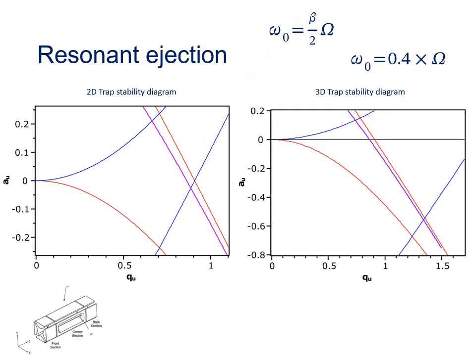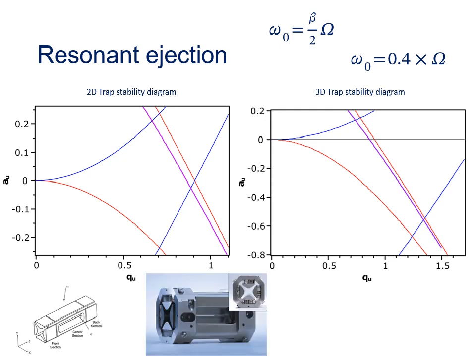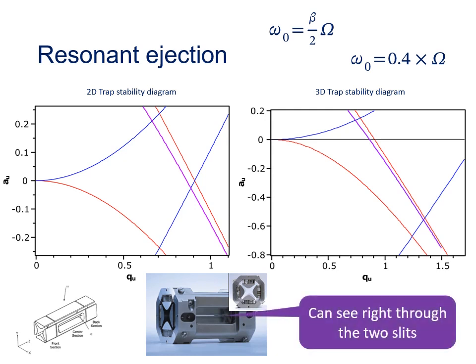As we said earlier, if we didn't use this approach, when ions reach the boundary of the stability region in a linear ion trap, they would become unstable in both the X and the Y directions at the same time, and so we'd have to have detectors on both axes. By using the resonance ejection approach, however, we now only need to detect ions in the X direction. And that's why, if you look in the central section of a linear ion trap, you'll find there's a slot cut in one pair of the rods. These will be the X rods.